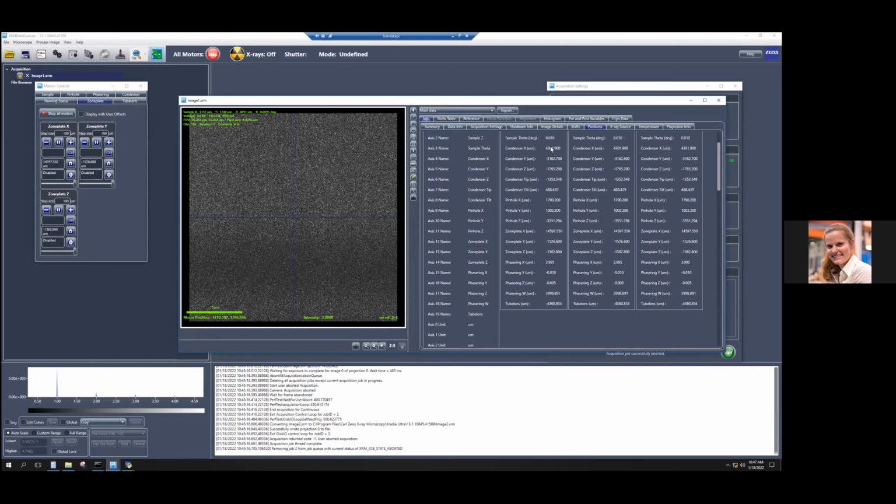If you look, they're actually all the same numbers, so it's not as complicated as it looks. Pick whatever column you want, and you can read off the zone plate X, Y, and Z positions and type those in. Remember to type them into this box and hit go, and then it'll go to that position. Okay. If you're using XMFlex to actually take the data, it will automatically calculate those and implement that on its own.